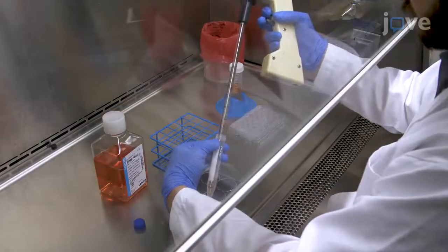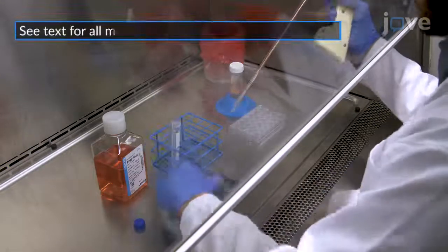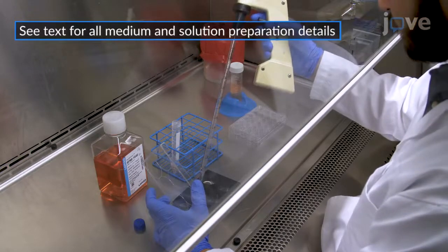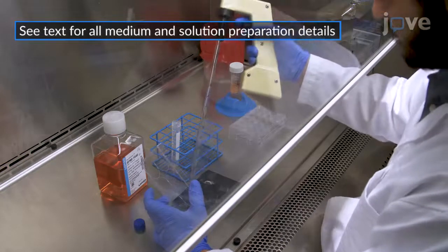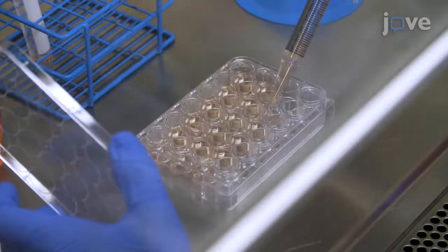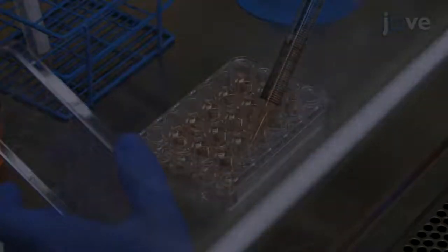To set up a host cell culture for the imaging and isolation of the mutagenized Chlamydia trachomatis, seed 6-well glass bottom plates with 6 times 10 to the 5th Cos7 cells in 2 milliliters of complete medium per well, and seed a 24-well polystyrene plate with 10 to the 5th Cos7 cells in 1 milliliter of complete medium.